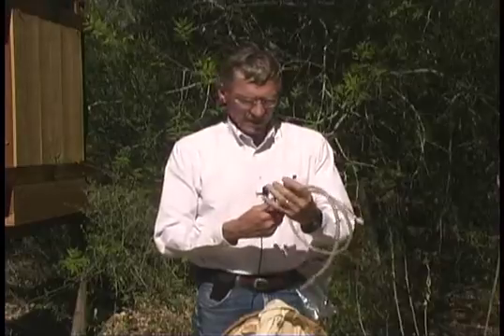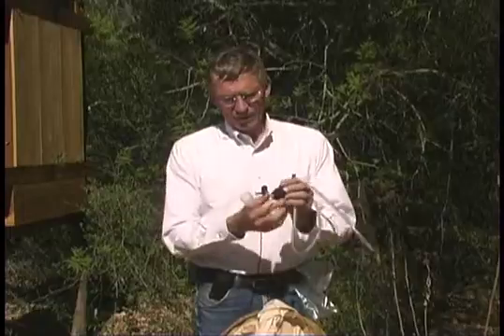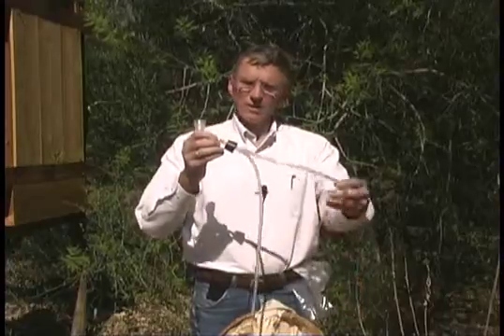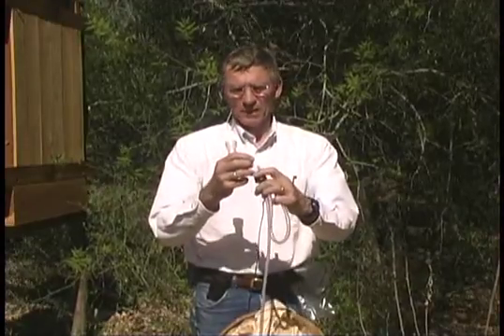This is a homemade aspirator that I made from basically a sleeve that I think is a 12cc syringe came in. I use that as a collecting body. I have a two-hole stopper with glass tubing. One is the suction end, which has a sheer piece of cloth over the end so that I don't suck anything through that suction tube into my mouth.